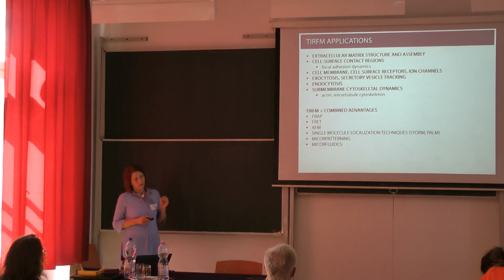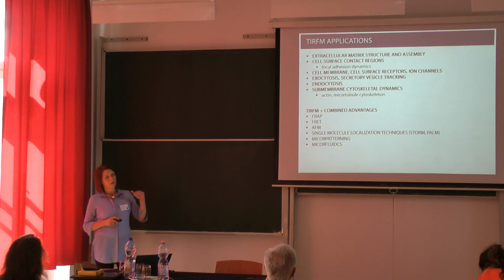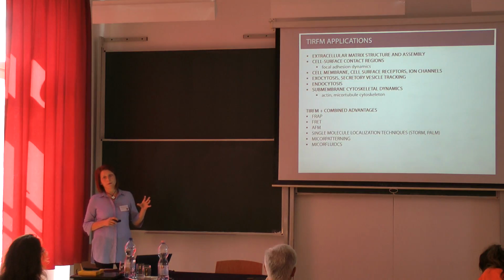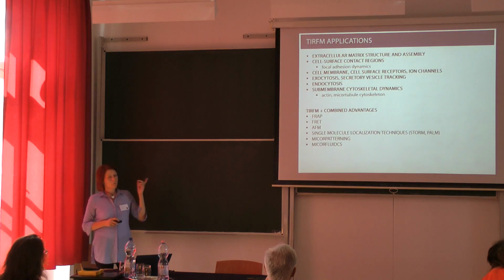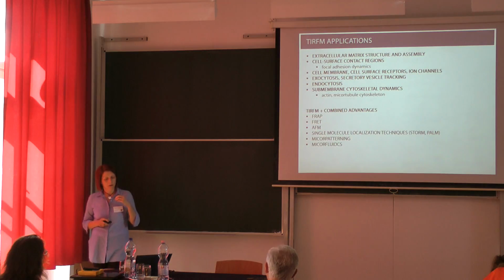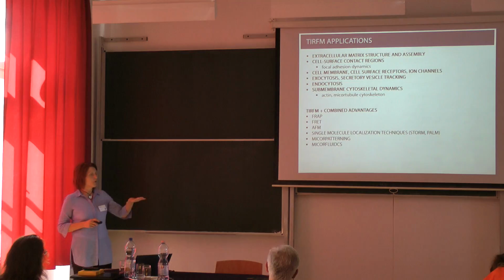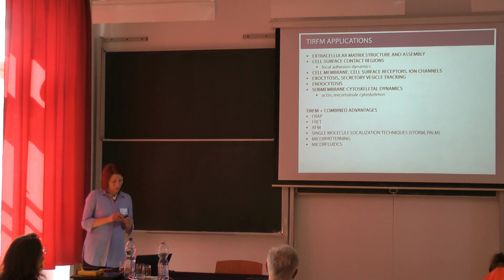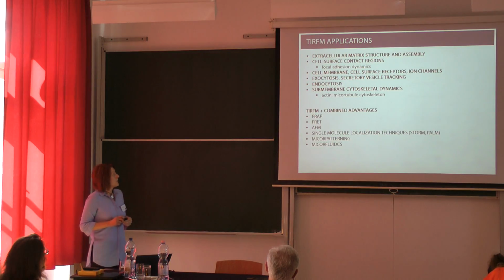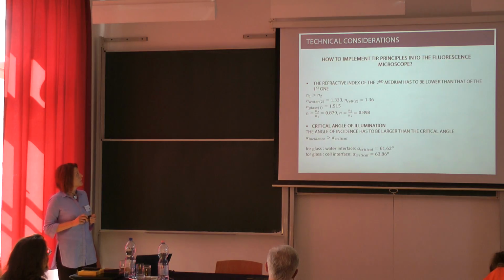Another very powerful approach is to combine TIRF microscopy with a technique we call micropatterning. If I have time, I will briefly introduce the principle of this technique, which allows us to generate different surface chemistries and different patterns on the surface, which can be useful in some applications, and also microfluidics. Okay, so now let's briefly see some technical considerations.